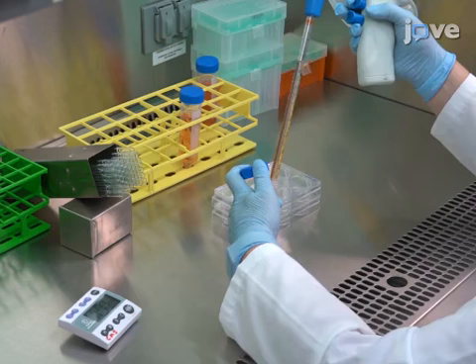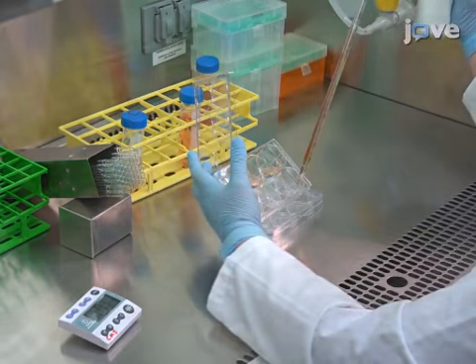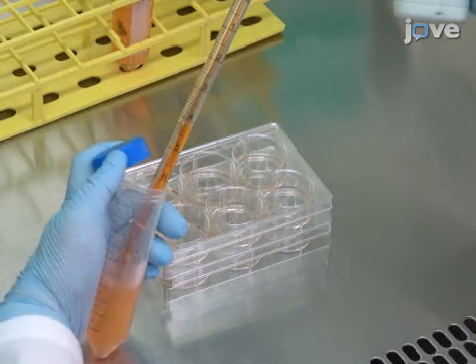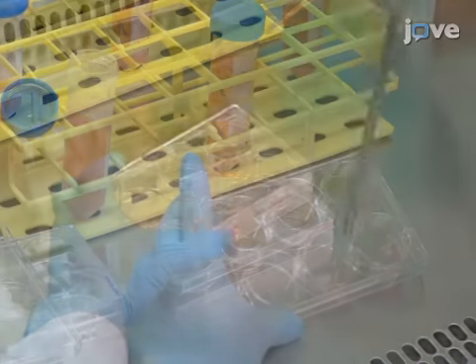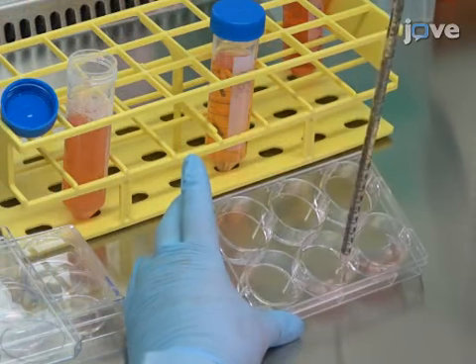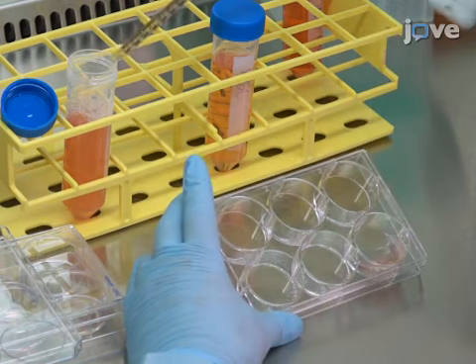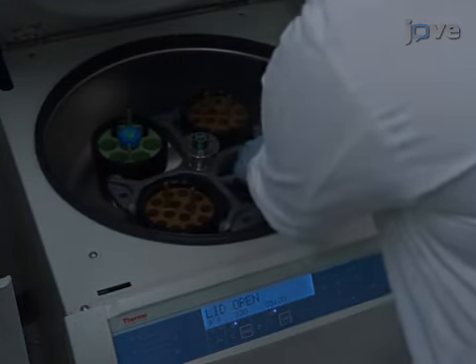After 1 minute, aspirate the trypsin and add 1 milliliter of stop media to each well. Using a cell scraper, scrape the cells off the plate. Then, add 1 milliliter of wash buffer to each well. With a 2 milliliter serological pipette, triturate the cells 3 to 5 times to break up large clumps, and transfer the cells to a 50 milliliter conical tube. Centrifuge the hPSCs at 330 times G for 5 minutes.